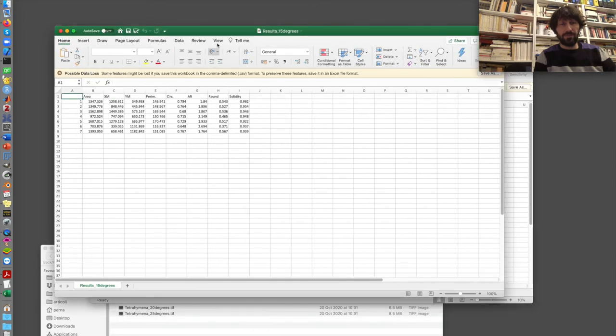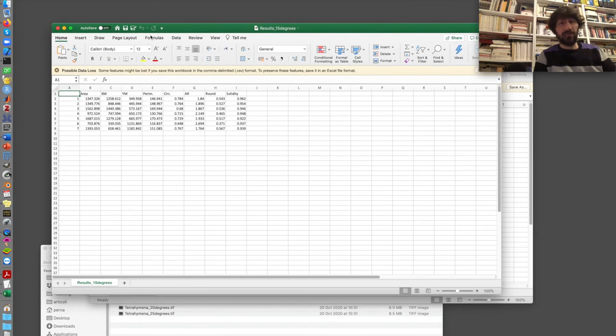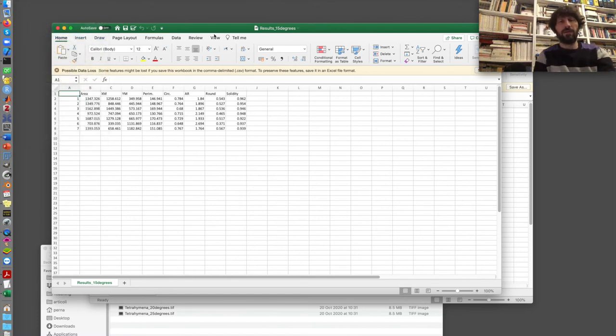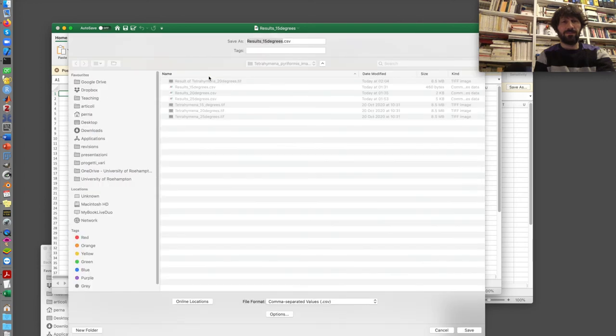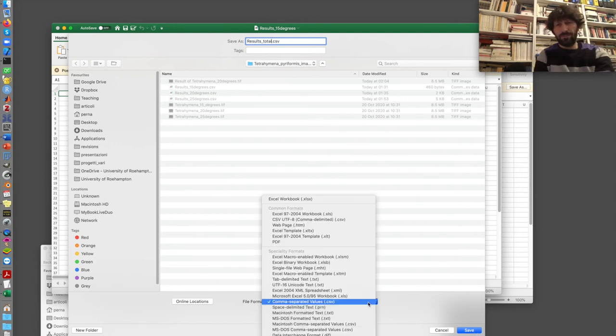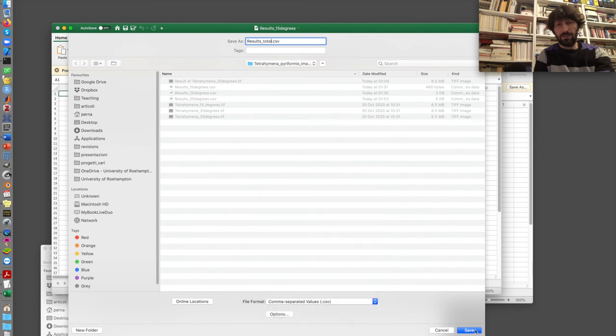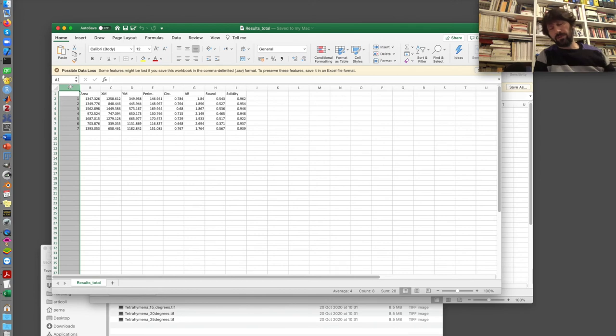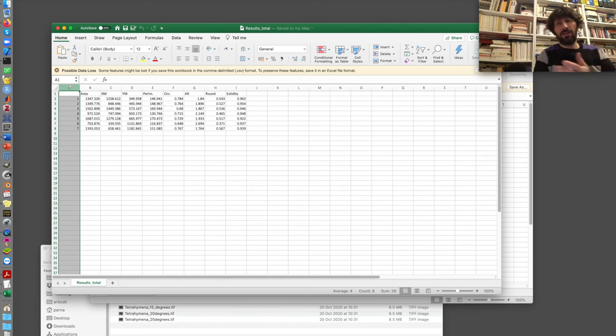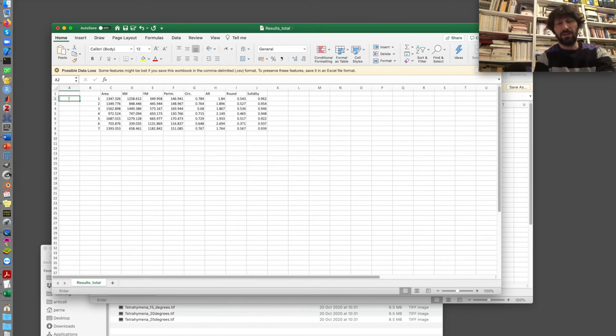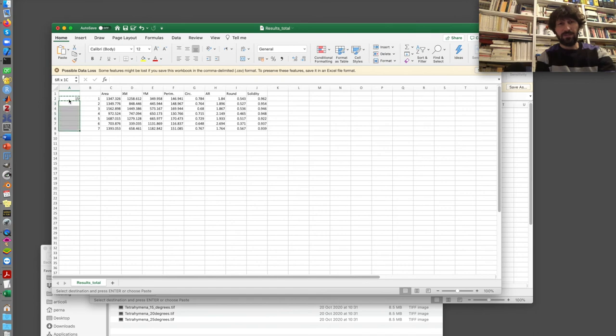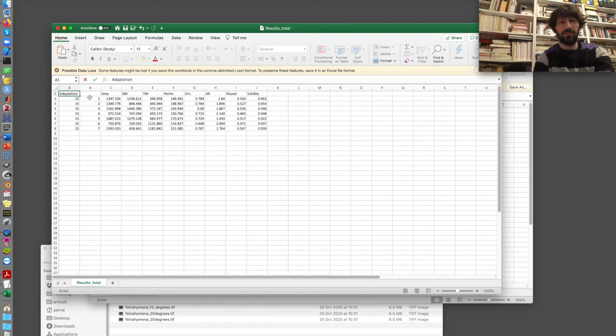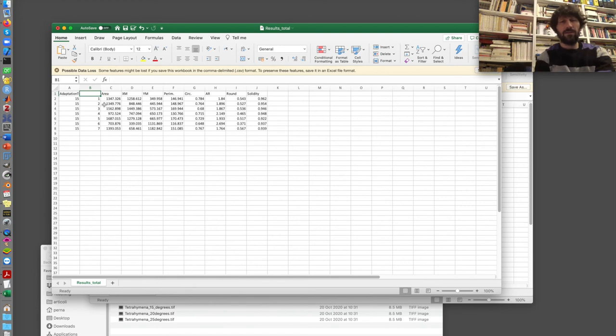So I start from one of them. The results are 15 degrees. I save with a different name. So results all total. Now, what I want to do, I want to combine these files so that I can have together the data for 15, 20 and 25 degrees. I need to insert a new column where I write what these numbers actually represent. In this case, it's 15 degrees. So I copy 15 and paste everywhere. Now, I call this Adaptation Temperature or something like this.